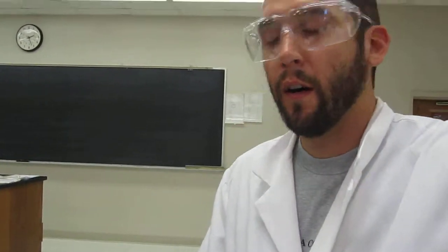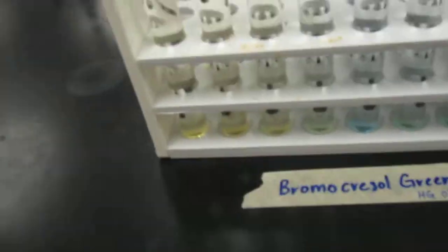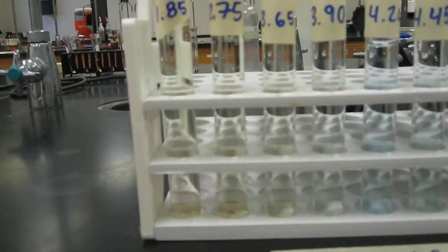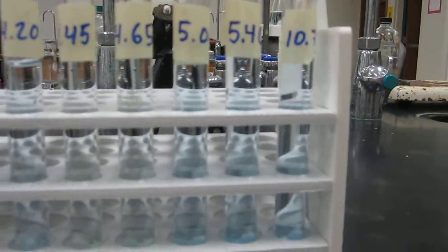Okay, so right now I want to introduce you to the three indicators that we'll be using in today's experiment over the three different pH ranges. So the first one is bromocresol green, and you can see the color change from yellow to green to blue.